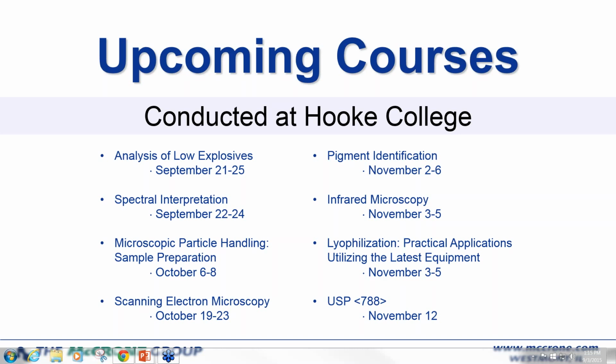in a compression cell. Diamond, of course, is a much harder material. It's a lot more expensive than KBr, but you can exert a lot more pressure with diamond than you can with KBr. KBr is a crystal that will crack very easily under fairly modest pressure. We sometimes use barium fluoride windows with a compression cell, which are going to be sturdier than the KBr, but still not as sturdy as a diamond. Okay, thanks, Kate.